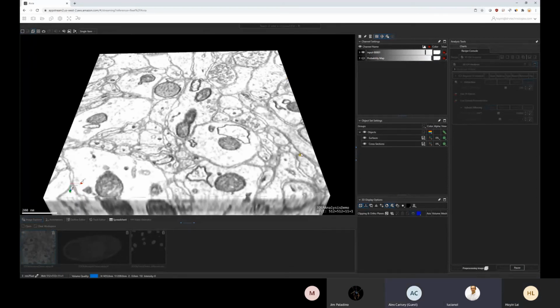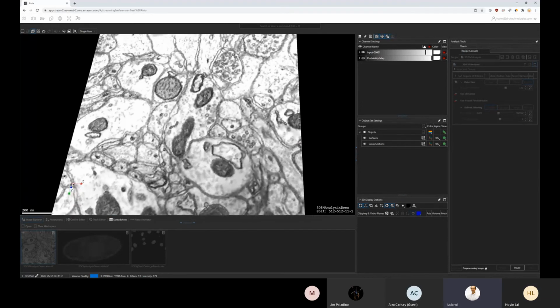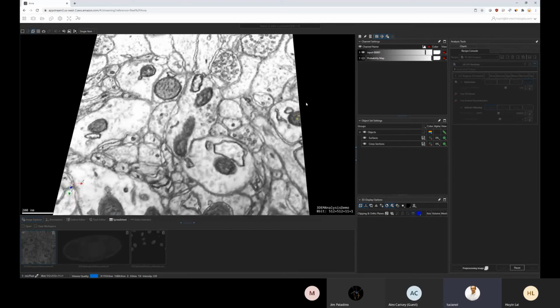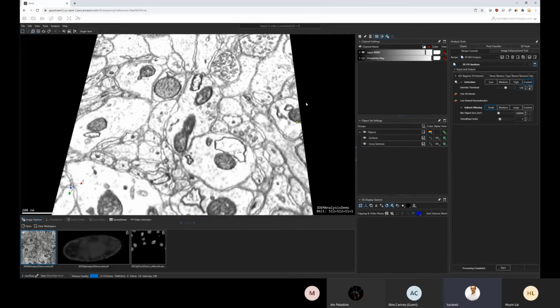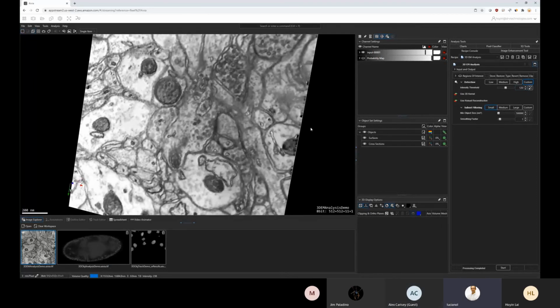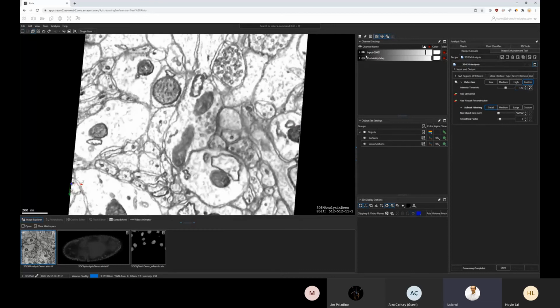Oh, it's still pre-processing the image. Okay. Very good. One thing I have not done yet is to try an apply on an ROI with this recipe. I don't think I've done that because this kind of ROI with the clipping is something relatively new that post-dates the launch of this particular recipe.